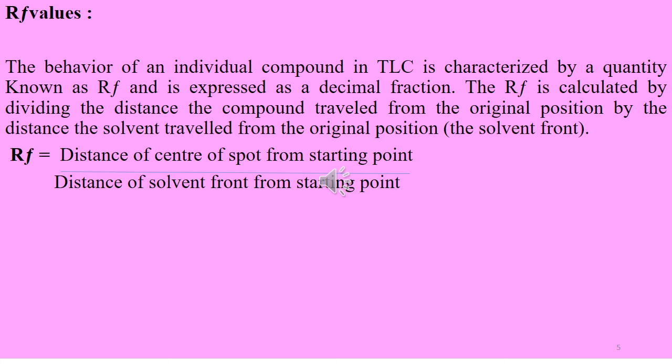When comparing two different compounds run under identical chromatographic conditions, the compound with the larger RF is less polar because it interacts less strongly with the polar adsorbent on the TLC plate. Vice versa, if you know the structure of the compounds in a mixture, you can predict that a compound of low polarity will have a larger RF value than a polar compound run on the same plate.